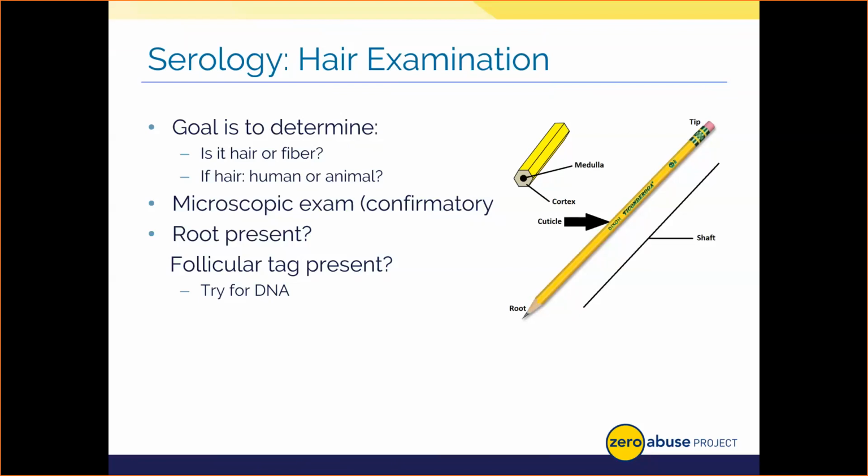And as I mentioned, we can also engage in additional examinations to help arrive at a conclusion for this type of evidence. The root of a human hair is typically club-like in appearance, and oftentimes because we get haircuts, the tip of human hair might be cleanly cut or razored. Again, to reiterate, hair and fiber exams are not presumptive, as there are definitive features that can allow us to determine if something is hair or fiber, or if it's human or non-human, if trained properly.